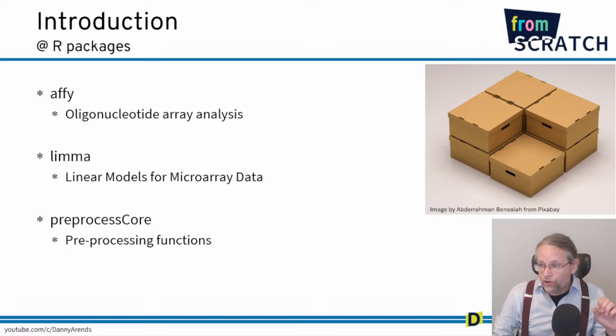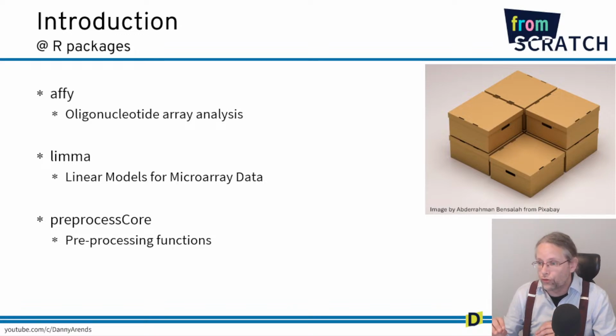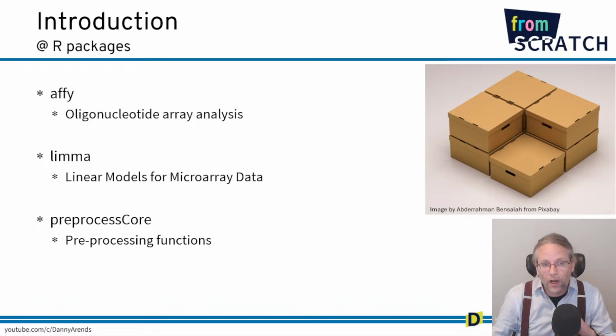So before we start doing the analysis in R, we need to have some R packages installed. So installing packages is done via Bioconductor. On the next slide, we'll see the commands to do this. But we're going to use the affy package because we are using an Affymetrix array. So this allows us to automatically load in the CEL files from our hard drive after we downloaded them. So Affymetrix is really good in providing annotation and analysis tools for their data set. So it's very easy to work with Affymetrix microarrays. There's nothing that you really have to do.